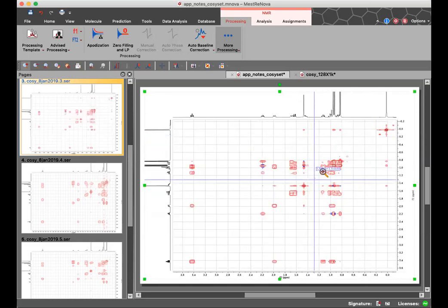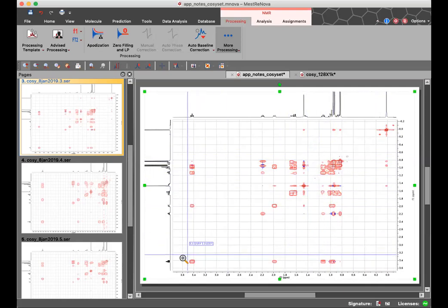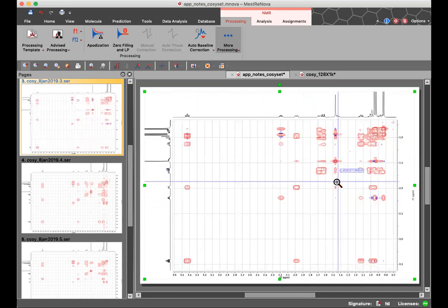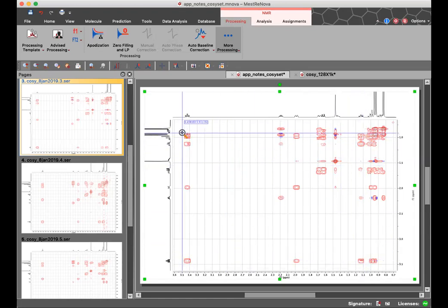But you also end up with these fake cross peaks, like you do in symmetrization. So you have to be aware of that. Also, here there's a little bit of water in the menthol, so you're getting a cross that shows cross peaks that aren't real. But it's a way to get a 5-minute spectrum looking a little more reasonable. You can start to see some peaks along the diagonal here that weren't resolved before, and these peaks are now two separate peaks instead of one blur.